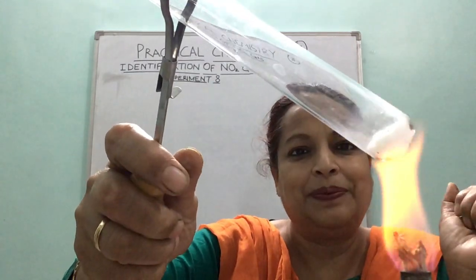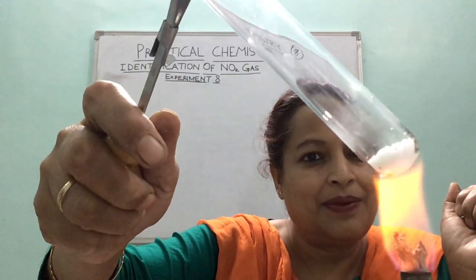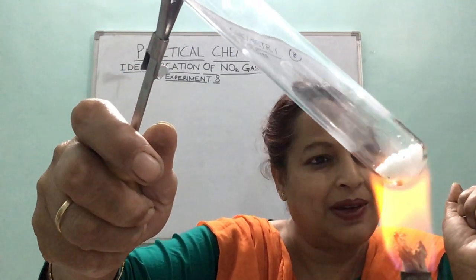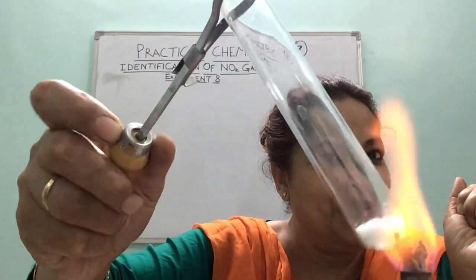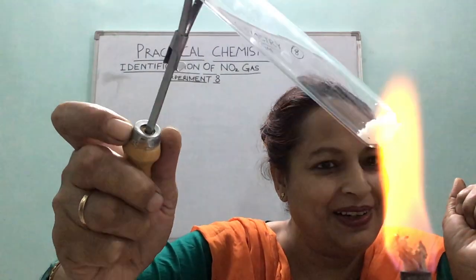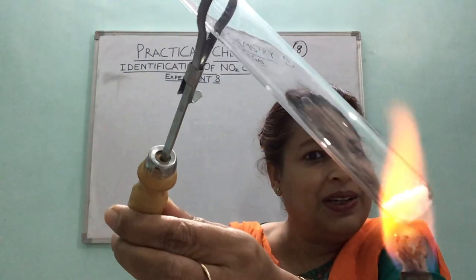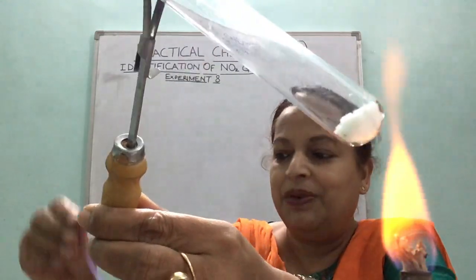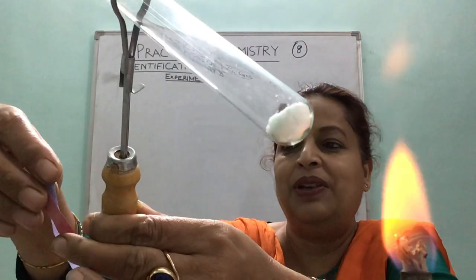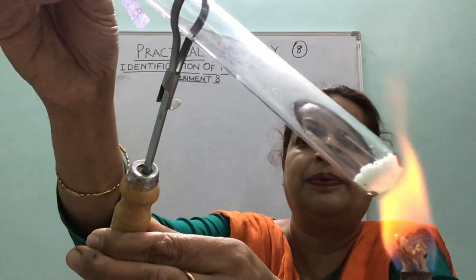Now lead nitrate, when we heat, you will hear its peculiar sound also. Now see. Can you hear? Can you hear this sound? Peculiar crackling sound, right? Okay. So it is decomposing. So lead nitrate is decomposing.